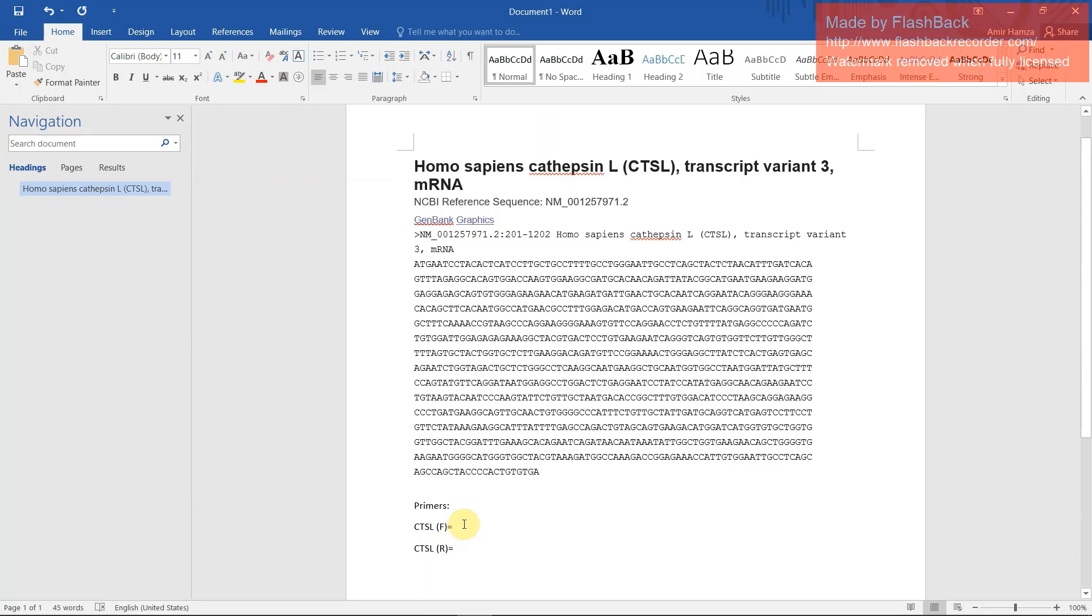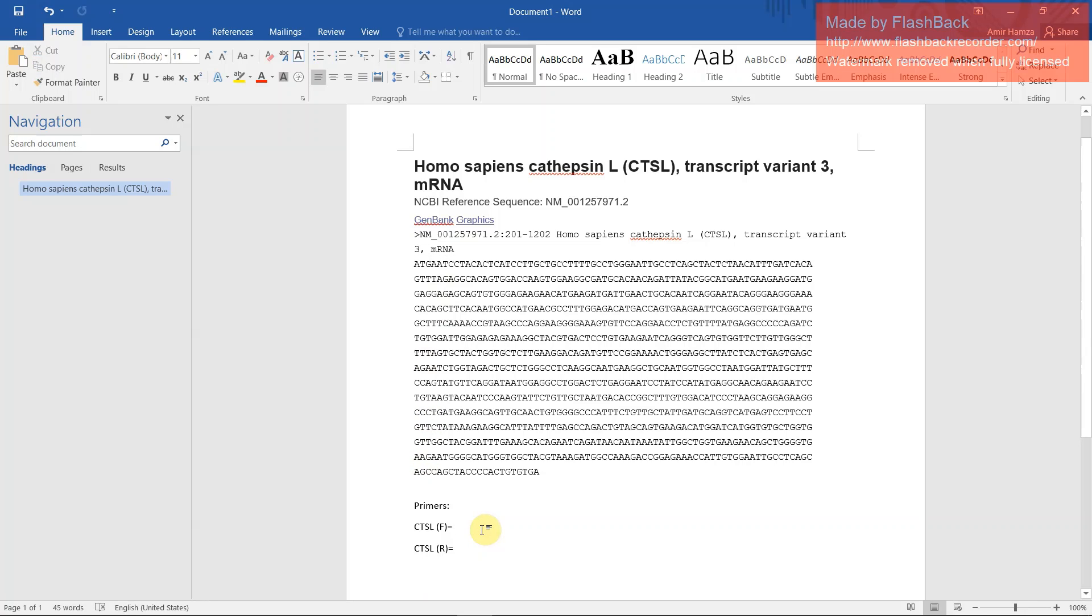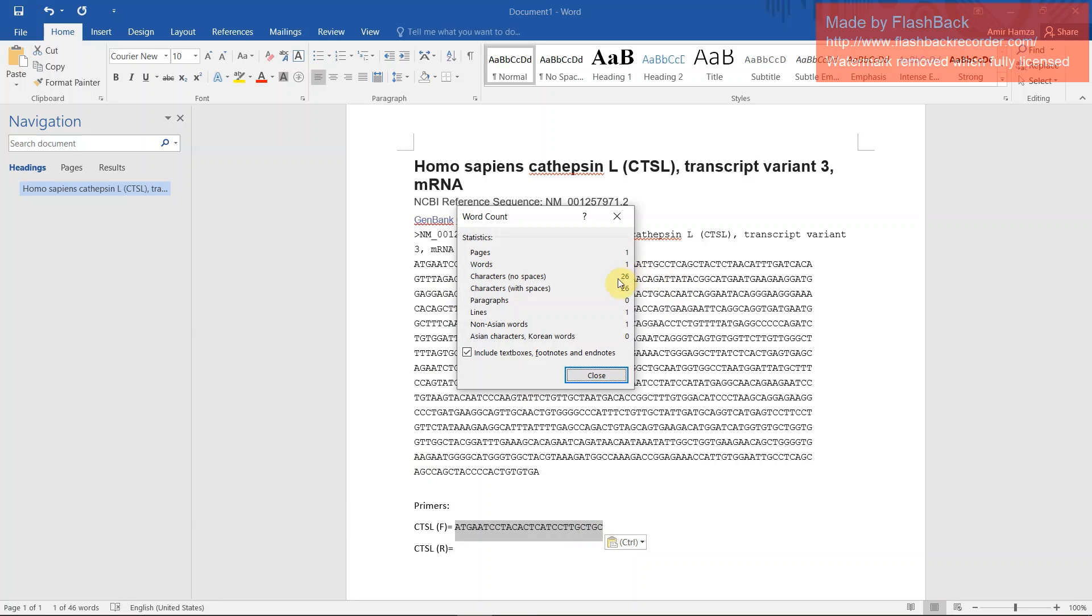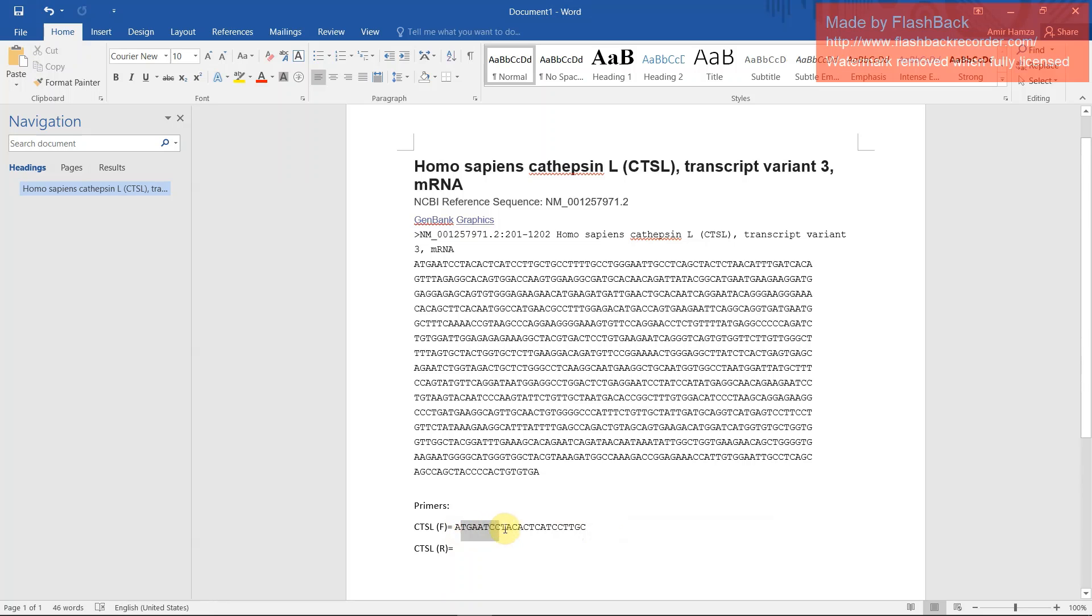Forward primer is easy to determine. Click here and the cloning primer select then 20, below 18 to 26 you can select. Now just click the shift key and right arrow and count. You have to count how much sequence you took. I want 23, so I delete this 3. You have to make sure that your sequence end position contains G or C. Here the end position is C.